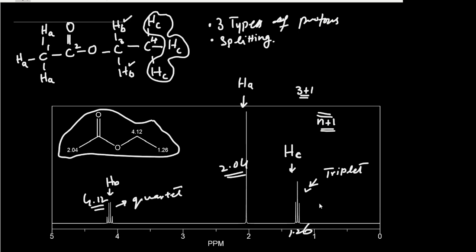Whenever you receive a spectrum, for example, if the molecule is not given to you, you have to interpret what my molecule is. You have received just a blank spectrum. For example, you are doing an experiment in the lab and you form a product, or you receive a product from the lab. So you have to check whether this is my molecule or not.